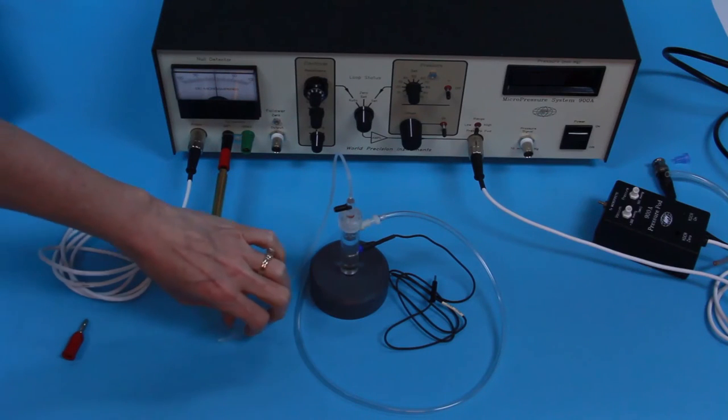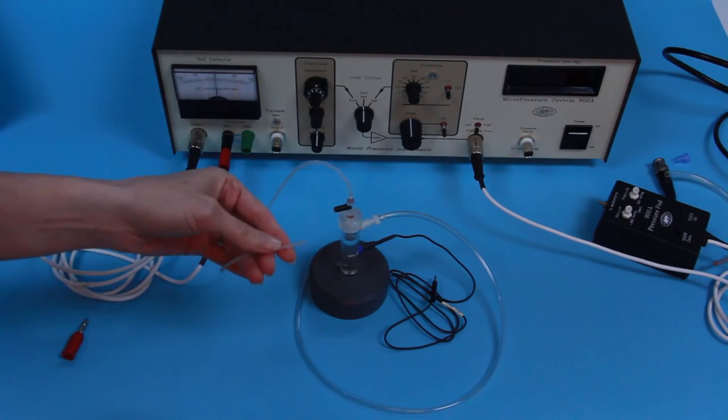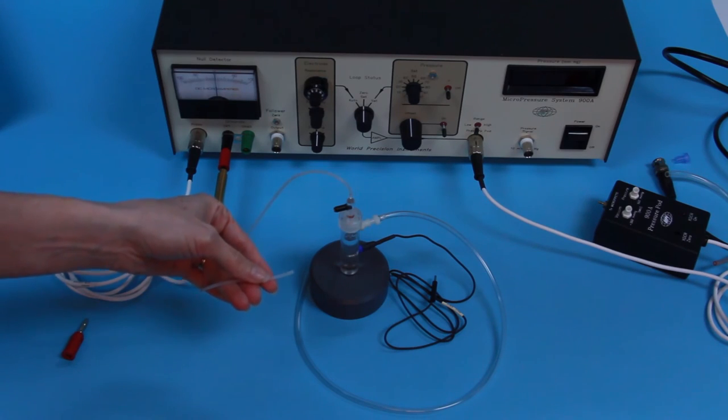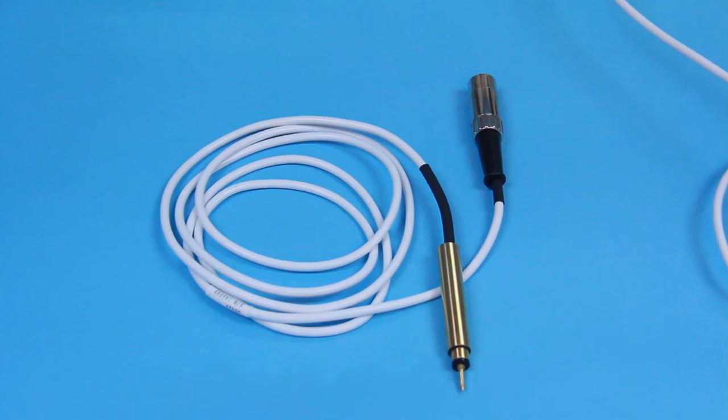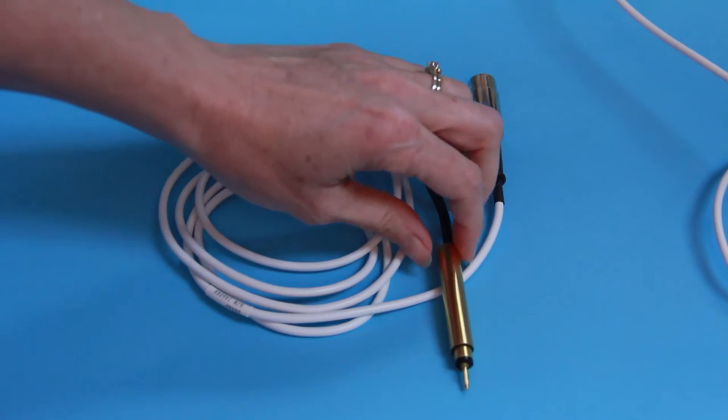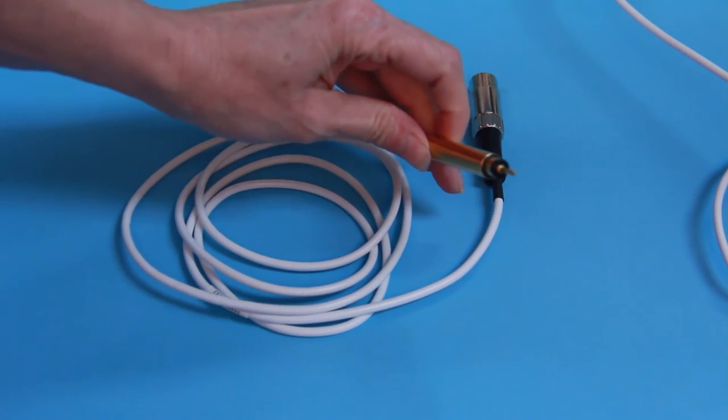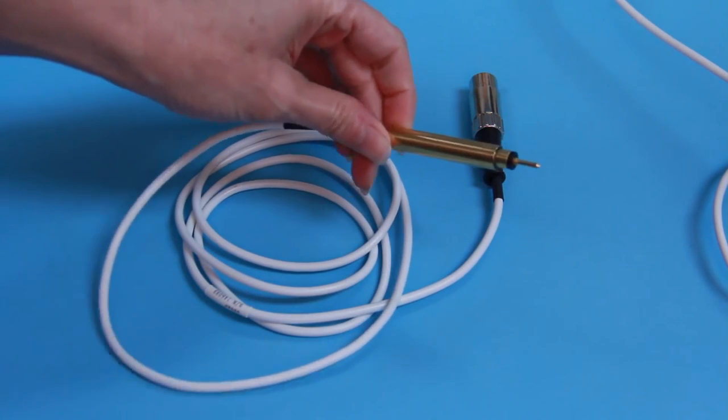The residual volume of the pressure chamber includes the micropipette, the connecting tubing, and the pressure transducer on the outlet side of the piezoelectric valve. The 900A accurately controls and adjusts the pressure in the chamber to match pressures applied externally to the microelectrode tip.